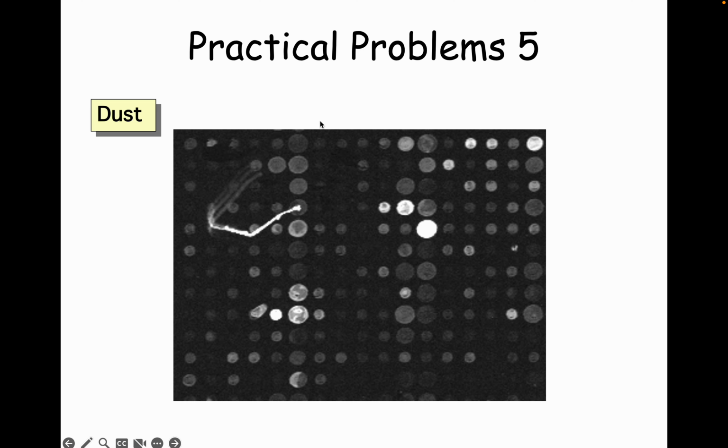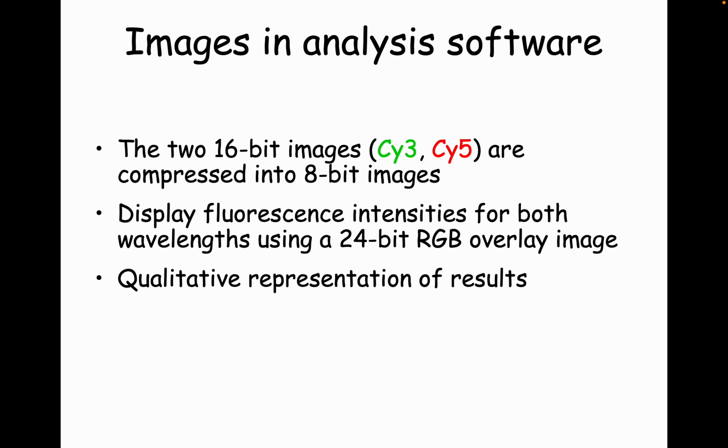And you can end up with, there's a little piece of clothing fiber. You would be surprised how beautifully fluorescent some little threads from clothes are. And there are some of them that glow bright green or blue or yellow or white. And they're really beautiful, except when they're in your image, because they make it very difficult to actually get accurate numbers. You would probably want to exclude everything that this string is touching and use some of the replicates of the same array.